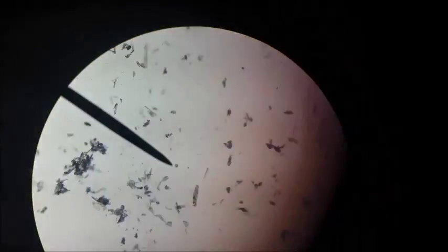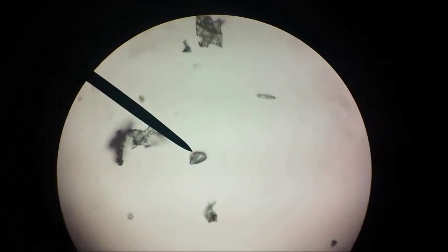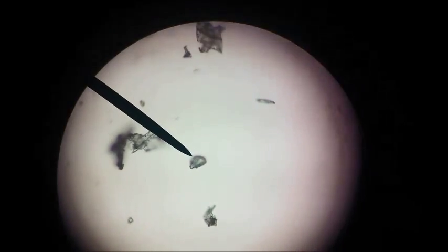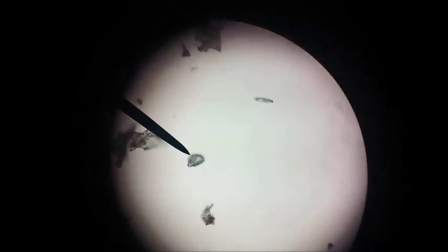Actually, this is 100x magnification, so we'll go up to 400x magnification. Okay, this is 400x magnification, and this little thing I have at the end of the pointer, this is kind of what I keep seeing everywhere. There are lots of these, and that's what is important in maybe diagnosing mold. And it's not very geometric. It's just kind of rather uniform in size, and I'm noticing that what I'm seeing on the internet for mold shows pattern, geometric type looking, actually pretty things in the shape, that is. I'm just seeing a lot of things this size, so I'm saying inconclusive so far.